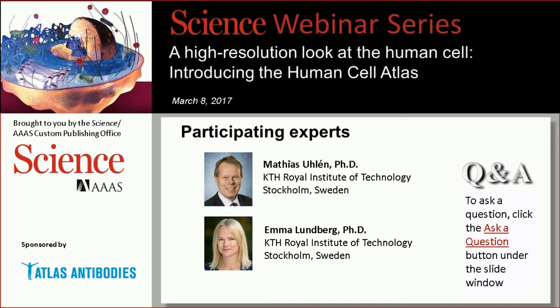Okay, fantastic, great. The next question: this viewer says, I missed the source of the antibodies. Are they commercial or are they generated within the project? So I can maybe answer that. Most of the antibodies have been generated in-house, but there are also about 10,000 antibodies that have been provided by other resources. We have made sure that all the antibodies used in the protein atlas are commercially available, so they can be used by scientists around the world.